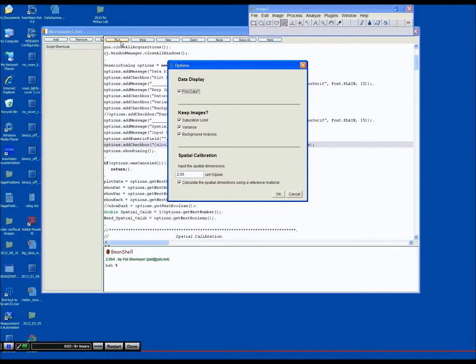Upon starting the script, you will be asked which data to display and store. If you are using this for the first time, we suggest displaying and storing all of the data available. For day-to-day instrument benchmarking, you will likely develop your own protocols for storing and accessing the benchmarked data.